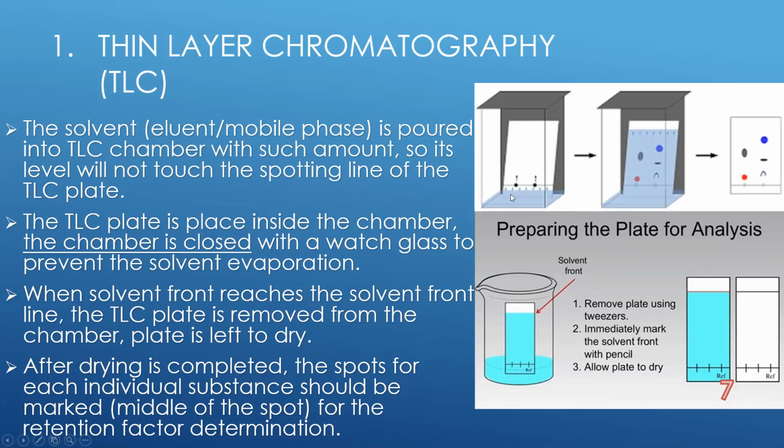So after we locate the chromatography plate in the chamber, the solvent level will rise and will travel from the bottom to the top. It will start from the starting line where it connects with the samples, and then travel to the top, to the finishing line, where such samples will be separated or left behind depending on the nature of the solvent.